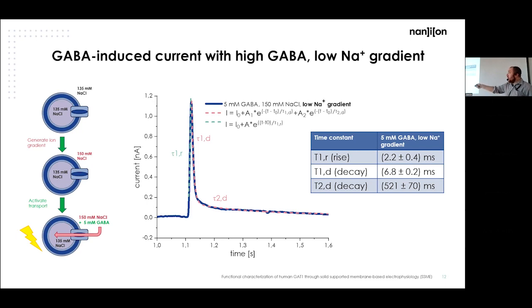And what you can see here is that now we lose the slow rising phase, and we have a very fast rising phase, followed by, again, a very slow decay phase through all the activating time. Again, I was not happy, because at this point I asked myself, where did the slow rising phase and the other decay phase end up?